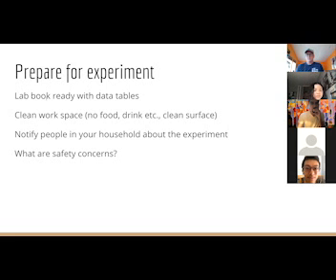The water could spill on your lap. That's about it. Yeah, you could spill some water. Someone could slip in the water, but that's really about it. You still should have goggles on, but I'll kind of let that slide for today. But when we're dealing with chemicals, you're definitely going to want to have goggles on. There's no doubt about that.